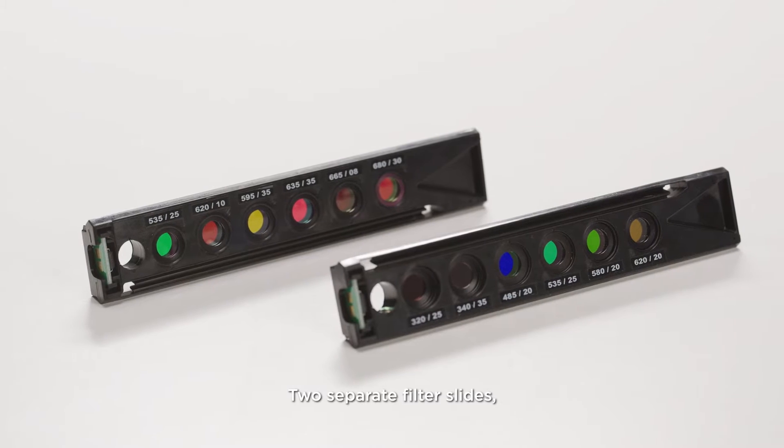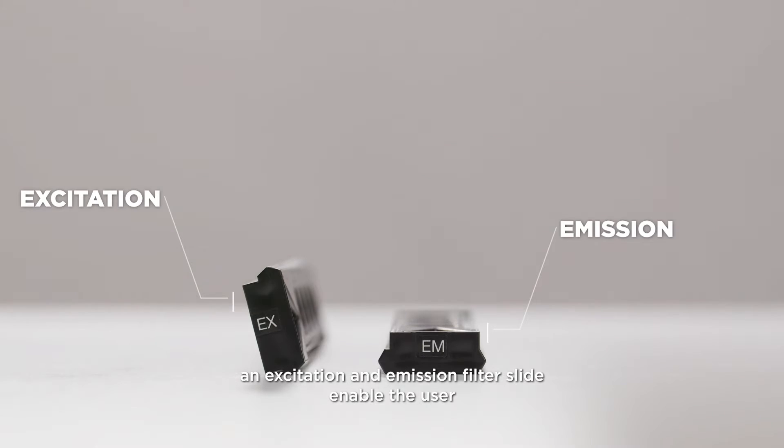Two separate filter slides, an excitation and emission filter slide, enable the user to work with six independent filter pairs.